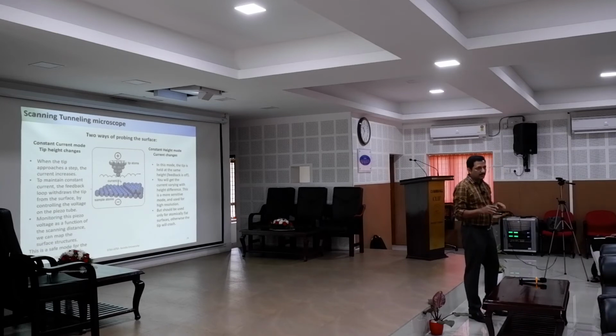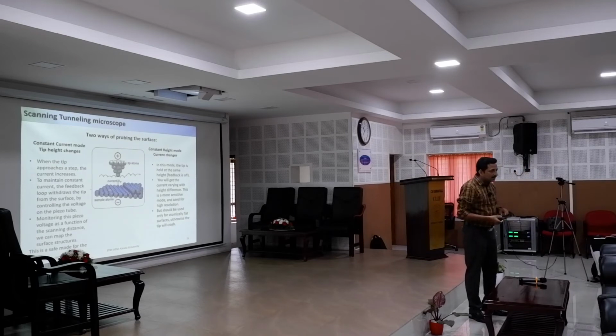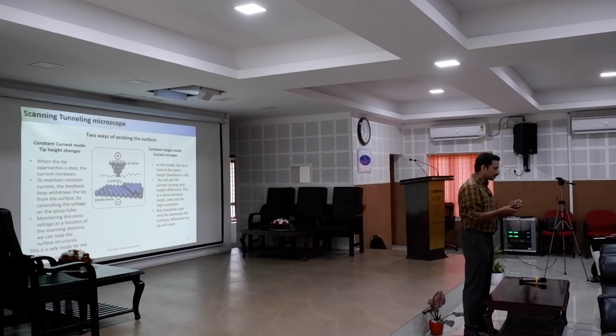And that is safe for rough samples, because samples are very rough. There are a lot of grains or grain boundaries, so it can actually go all along with the same height. See, normally more than a micron roughness, we don't use STM. Okay, and then what happens? Now that's the next question. If it is very rough, like a micron size, see the RMS root mean square roughness is about 1 micron.